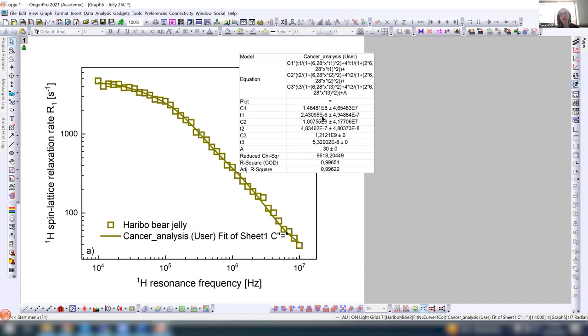So it's indeed like -6, -7, -8, but of course it got adjusted. You see, the trick sometimes is just really to fix this frequency independent term, because fits usually behave in such a way that, as the values here are larger, the software tends to reproduce this part of the data, but not this one.